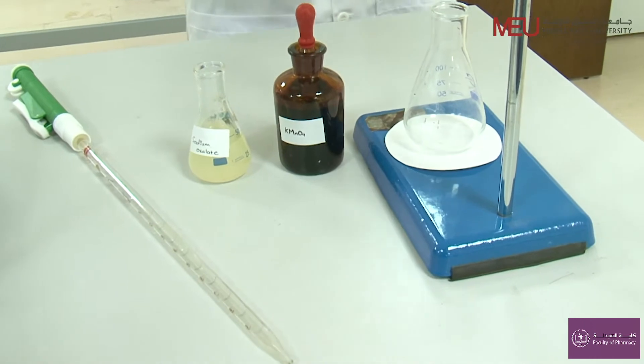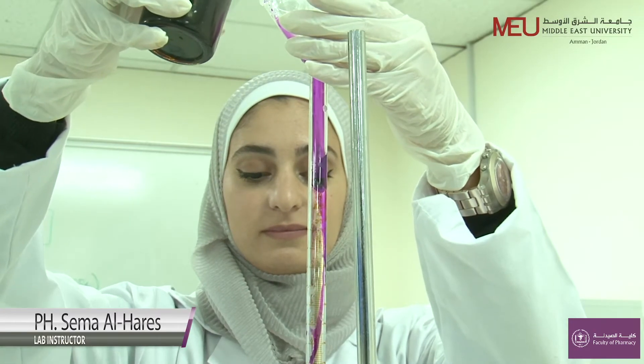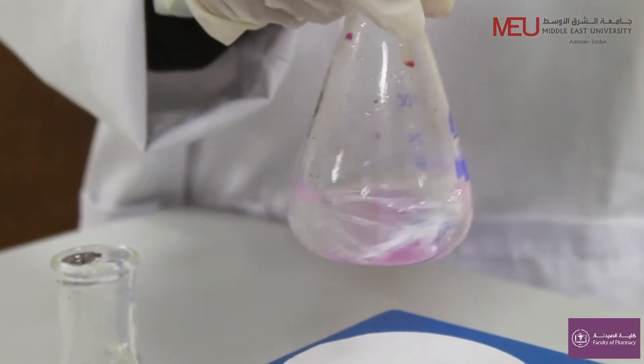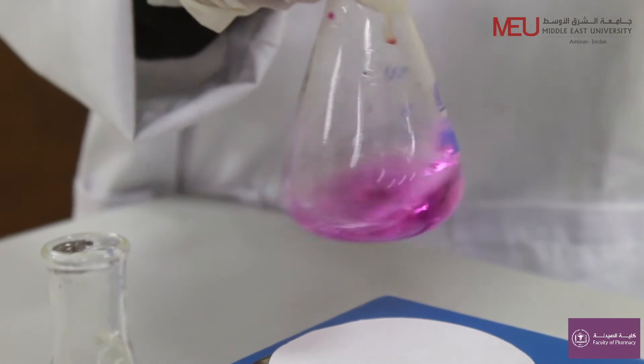Welcome to Redux Titration Procedure. Redux titration is like the acid-base titrations that you've done before, but instead of an acid and a base, we just react a reductant and an oxidant.